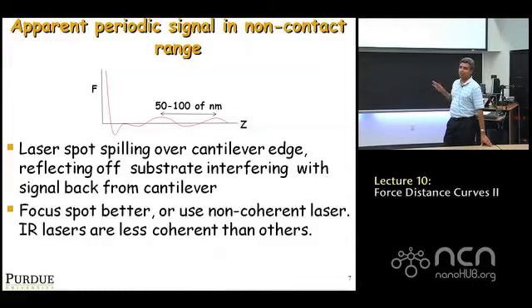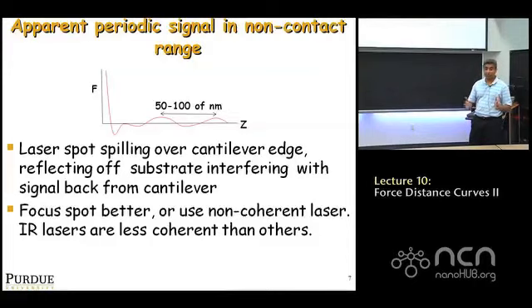So if you're doing AFM, your Z range should not be more than 100 nanometers ever, except under special conditions. Those special conditions are, for example, maybe you're looking at indentation of live cells, where there are really big fluffy objects, or you're pulling polymers, or you're pulling individual protein molecules, and so on.